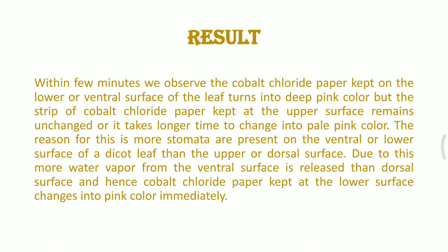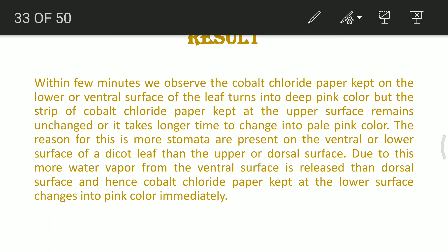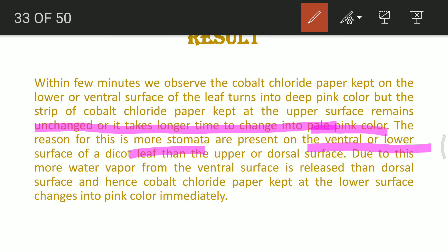Within a few minutes, we observe the cobalt chloride paper kept on the lower or ventral surface of the leaf turning deep pink, while the strip kept at the upper surface remains pale pink or largely unchanged for a long period. The reason is the presence of most stomata on the ventral or lower surface of the leaf compared to the upper surface in case of dicot plants.